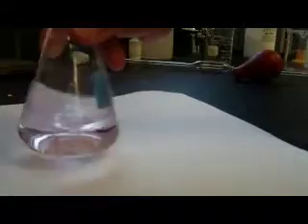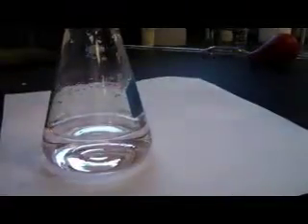Sands, I think you're there. I think you're right. Now, I'm not sure the video is going to show this, guys, but it has a pink color tinge to it. There you go. There's just the very slightest pink to that. That's the kind of pink you're looking for. You want the faintest pink you can actually get.